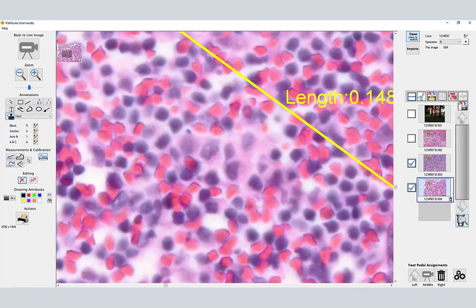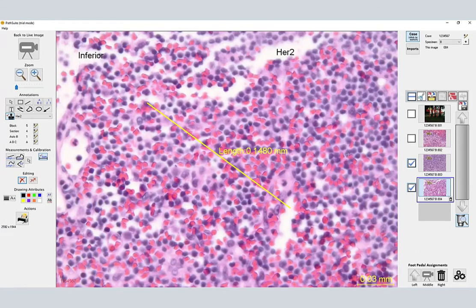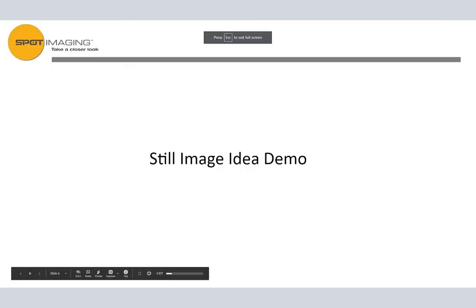Okay, so that's the IDEA series cameras. I'm running this one with a 0.5x, and this is on a Zeiss scope right now. So I think that's pretty much on that one. And so I'm going to close that out, and then we're going to go back to the presentations and talk about live imaging.